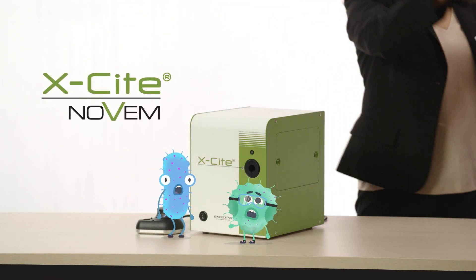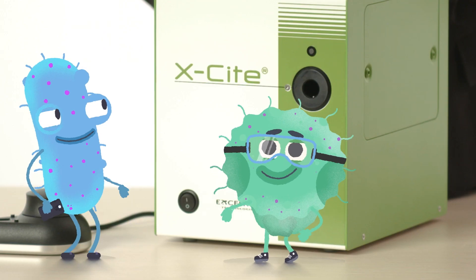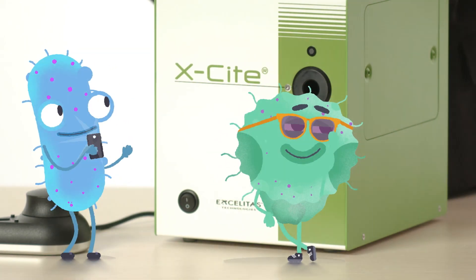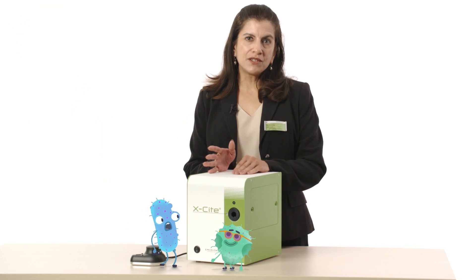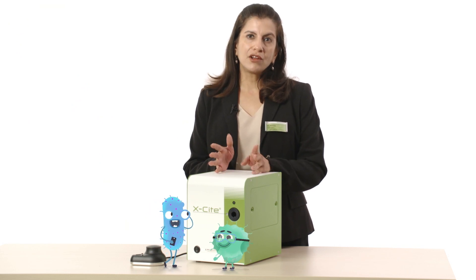Did you know that the new X-Cite NOVEM is available in several different models? There are different configurations available, each with nine channels, which peak a little differently depending on your application.